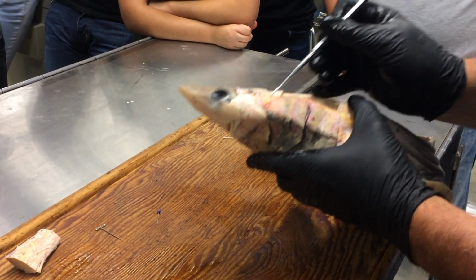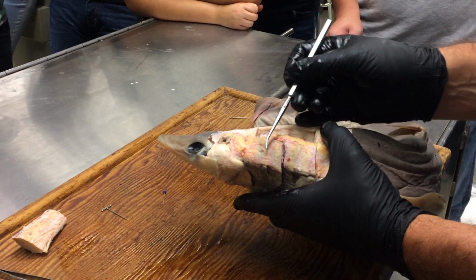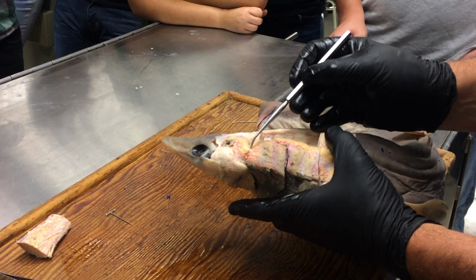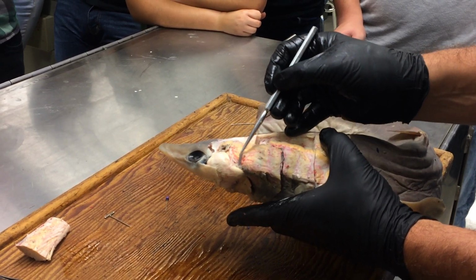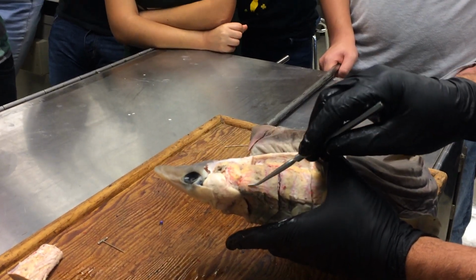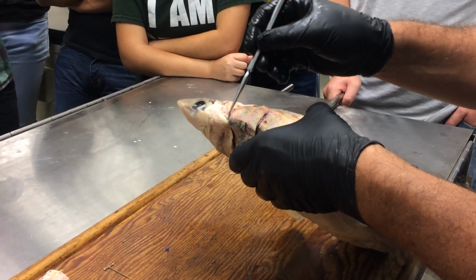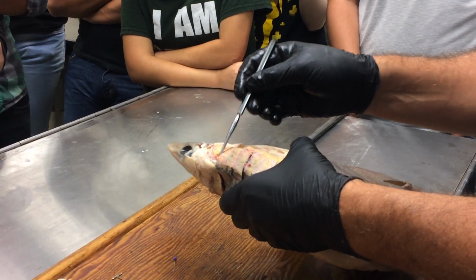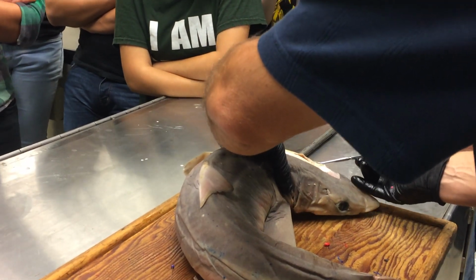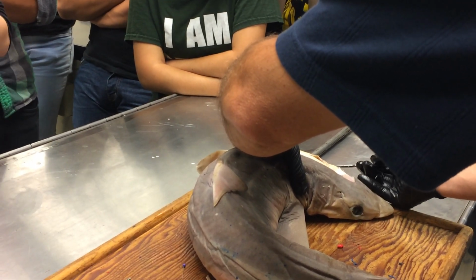And then right behind it, and not very distinct, is this muscle in here, which is the dorsal hyoid constrictor. And the fibers seem continuous, but you can see that this muscle actually is attaching here to a skeletal element, whereas this just runs around in the wall of that branchial pouch. So the best place to separate them is right at that region of the jaw joint. You can kind of see that there's a division there. So you guys over on this side, so you couldn't see. Here's levator hyomandibulae. This is the dorsal hyoid constrictor, and that's that division right there that you can make between them.